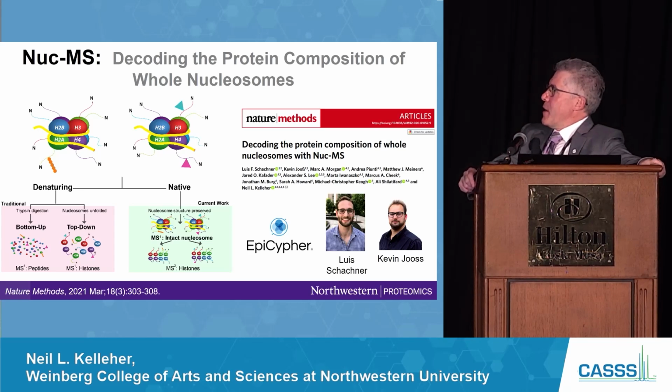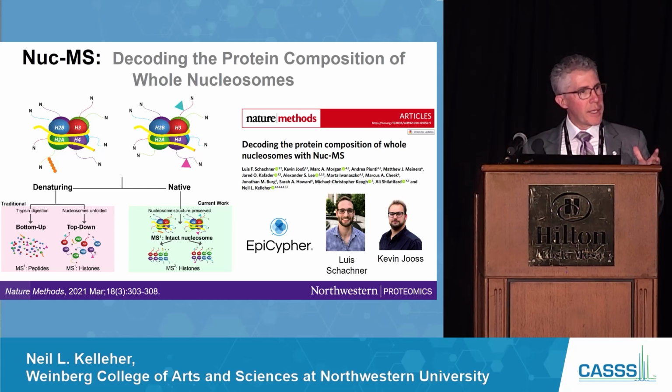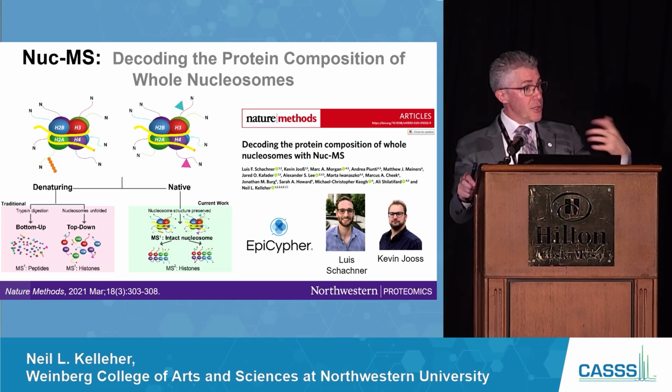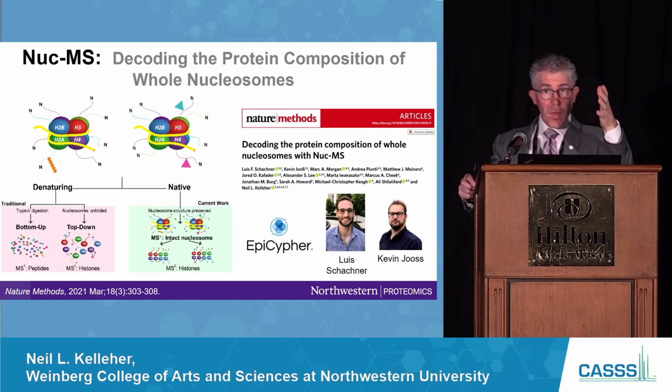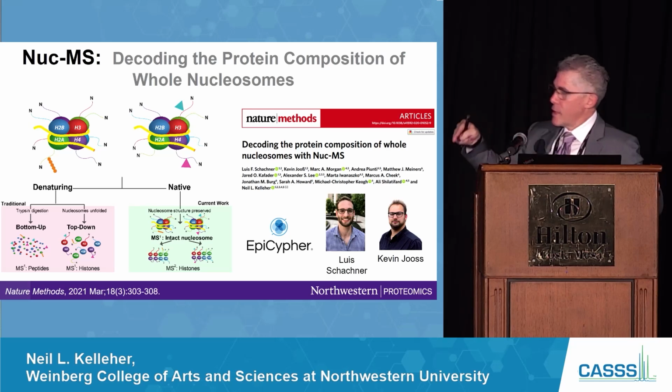And yeah, so let me switch back to CZE and show you an application that you may not have seen coming. It's not antibodies. It's nucleosomes, endogenous nucleosomes, and how CZE was able to explain what is actually in the mixture. From what you may know and from your chromatin epigenetics and cancer epigenetic programs, which I'm sure many of your drug companies have, are targeting chromatin remodeling enzymes.